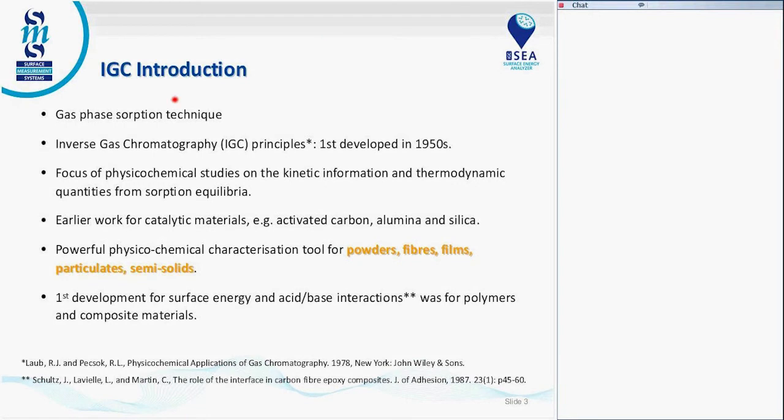Inverse GC is a gas phase absorption technique. It was not invented by Surface Measurement Systems. It was developed back in the 1950s and been used in various industries, from polymers to fillers to aluminas, silicas, large amounts of materials, pharmaceutical materials. It's applicable to powders, fibers, films, particulates, and even some semi-solids.